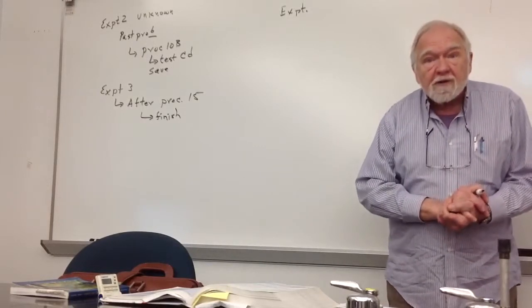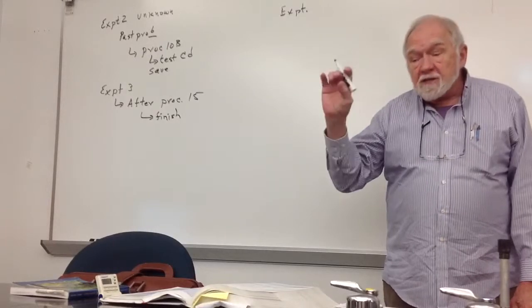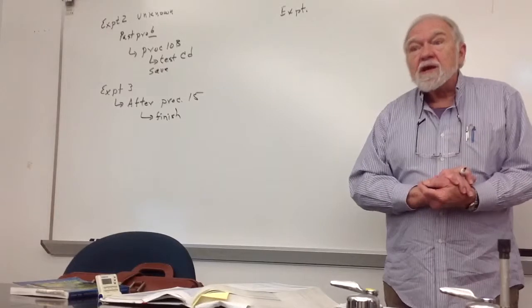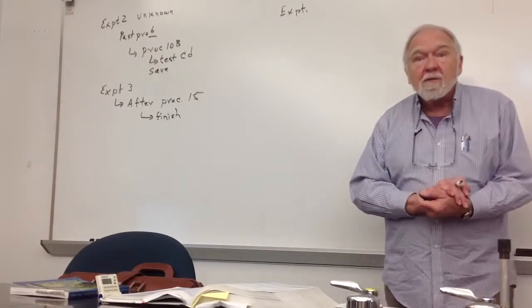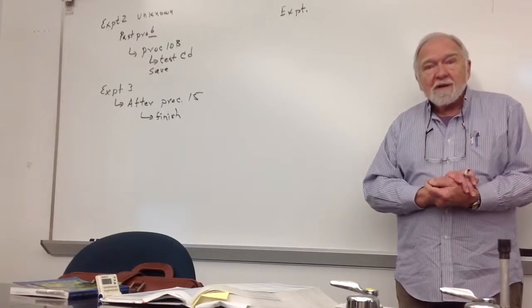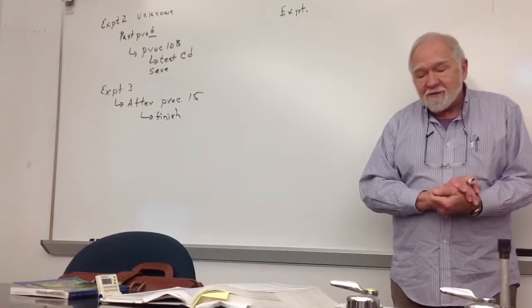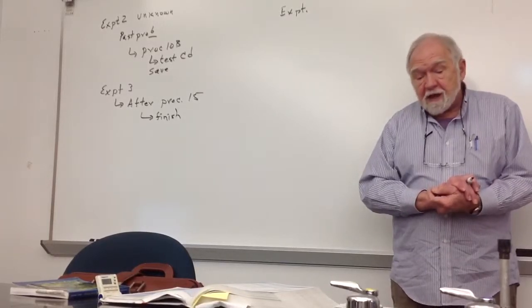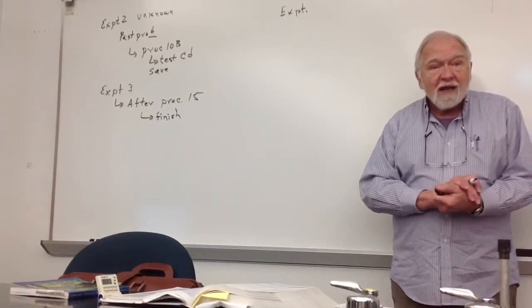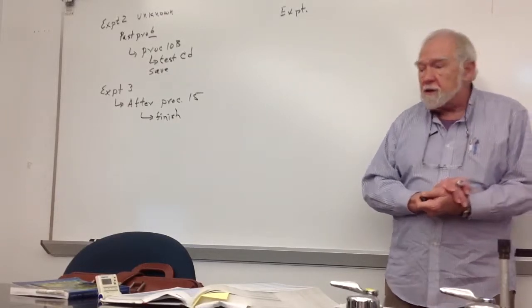If you want the reference ones, all you do is calculate your drops, put the drops into a test tube, and add the particular reagent. That will give you more precipitate than you would get for a medium if you went through the entire procedure, but not much more, because you don't have a chance of losing anything. You're really careful and don't lose things as you go along your various steps, and it doesn't matter. So you can do the known precipitate test simultaneously with the separation of the different ions in procedure 4.